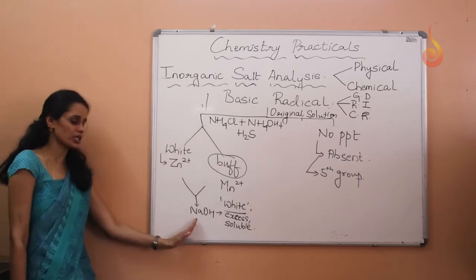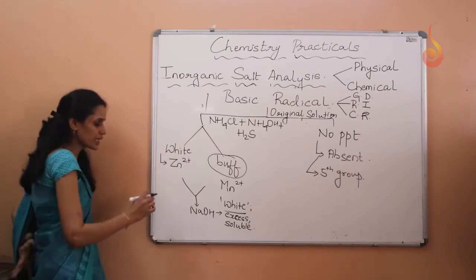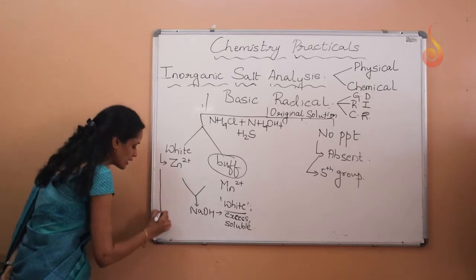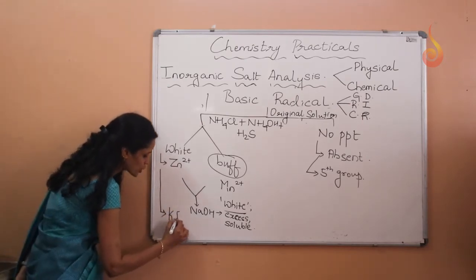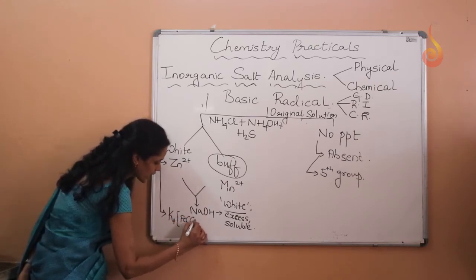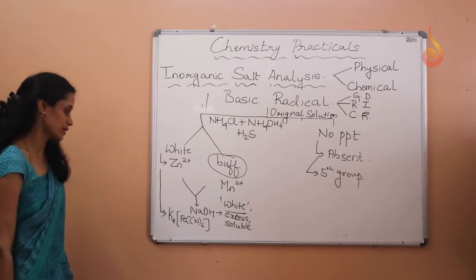Other than NaOH solution, we also use another reagent for zinc confirmation, which is potassium ferrocyanide solution.